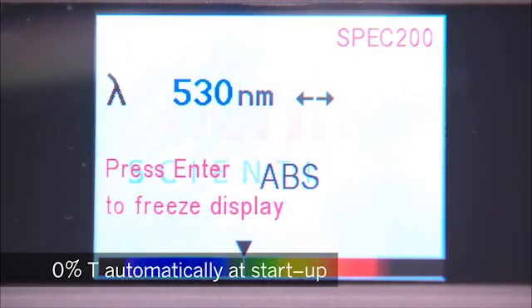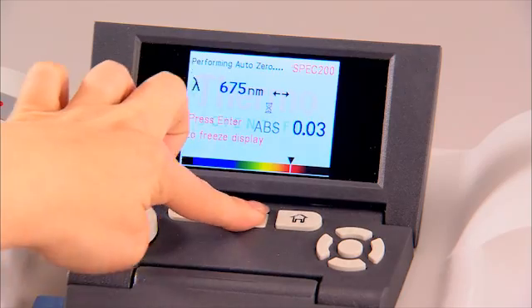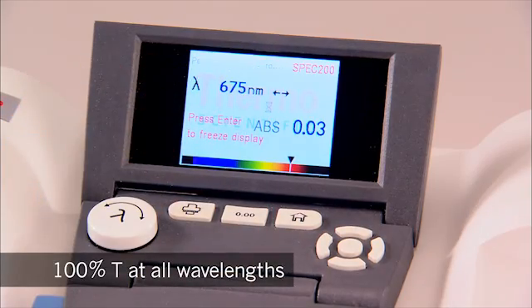Zero percent T measurement is done automatically at startup, and the AutoZero function records 100% T at all wavelengths.